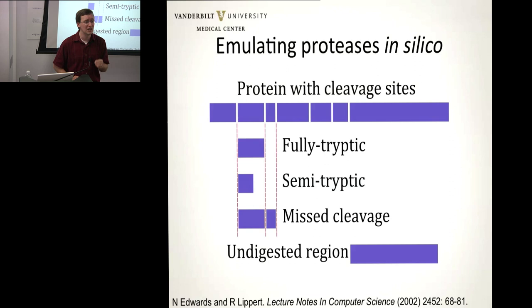If you've got a sample that's got fewer than 100 proteins in it, you probably want to invest time in doing a semi-tryptic search. Because those semi-tryptic peptides, even though they're lower in probability than the fully tryptic peptides, still occur at some lower probability. And if you've got less than 100 proteins in your sample, odds are you're going to see some of those semi-tryptics in addition. We always do searches with semi-tryptic specificity because it's also very useful in figuring out which peptides or which spectra were identified successfully at the end of the day.